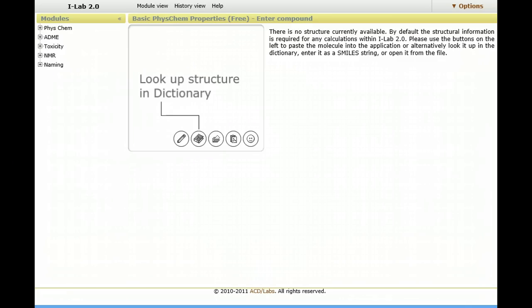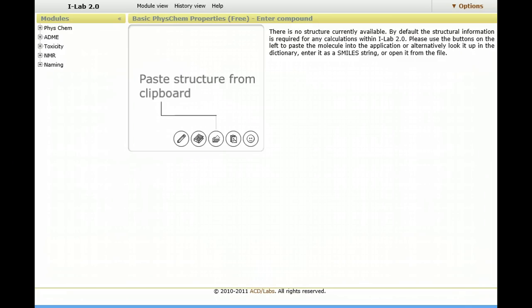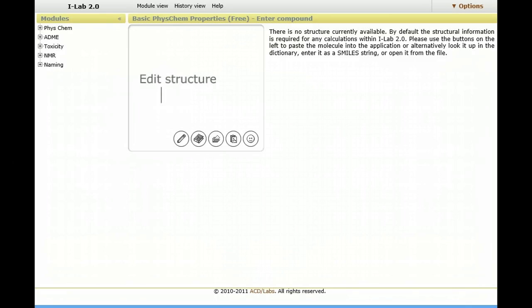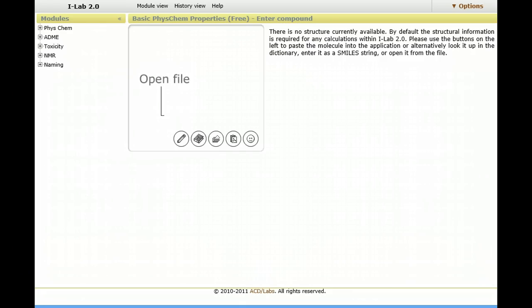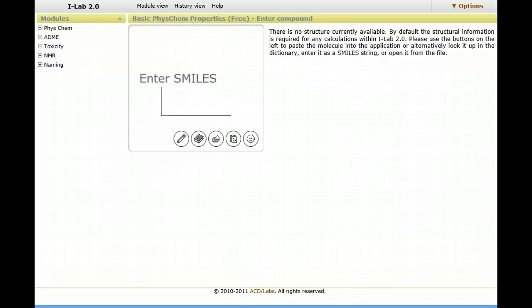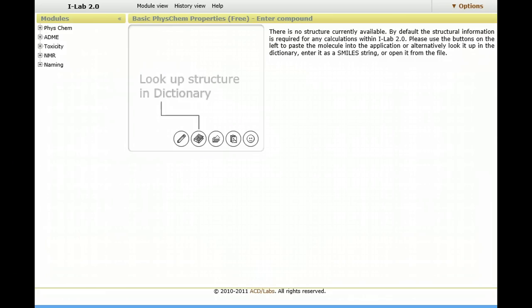You have the ability to upload a chemical and you can either draw it or convert the name to a structure or upload a mole file, for example, and then search across a series of databases, physical property databases, NMR databases, etc.